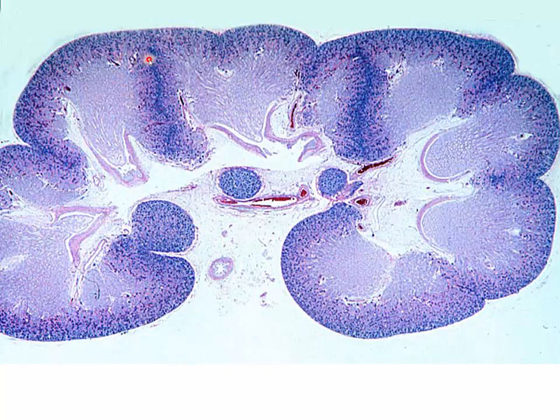Our arcuate vessels, like we just saw, are going to be running right along this border that we see right in here. And these folds, I mean, it's kind of a weird cut. I'm not exactly sure because we've got cortex tissue sort of curving around here. So this might be a tangential cut through maybe what they're referring to as a kidney lobule. But once again, we see our renal pyramids, the papillae, and here we see our calyces.